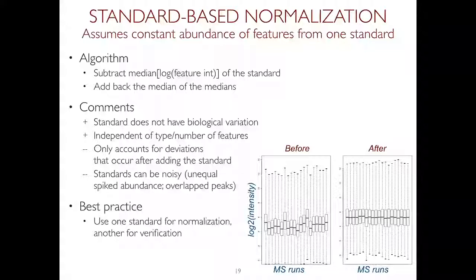So we try to keep it simple also, right? For the moment, we have either single standard or constant normalization or quantile normalization. So far it worked, but the more complicated it is, the more opportunity you have for it to fail and not notice, right? So I would say we try to do good enough for many studies, as opposed to going in depth, but then realizing that it may be overfitting or overdoing something in some cases. Yeah.